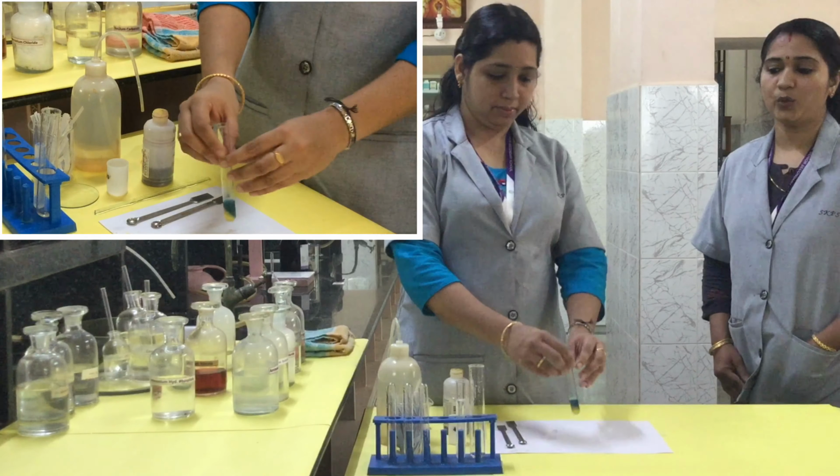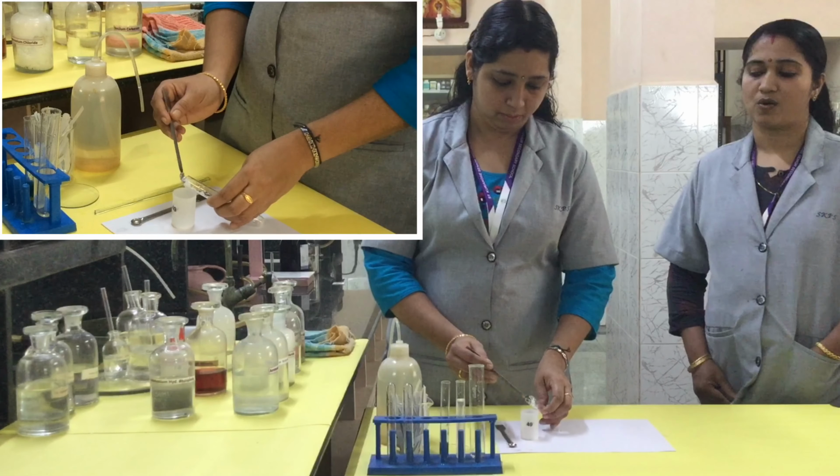Next, we want to do another confirmatory test for magnesium, which is called the ash test. For that, you have to take the salt solution in a test tube. Take a saturated solution of the salt to get better results.